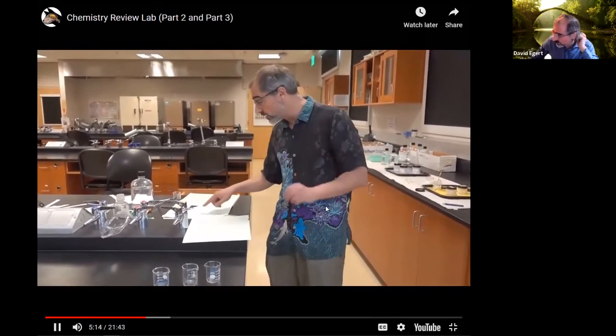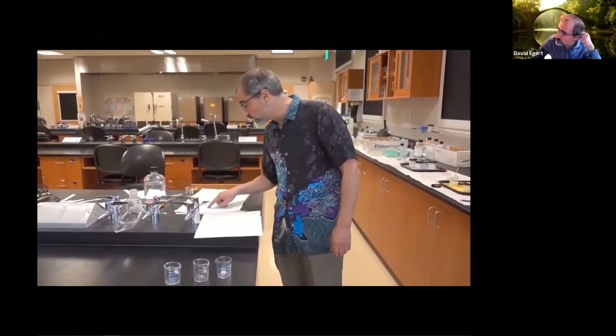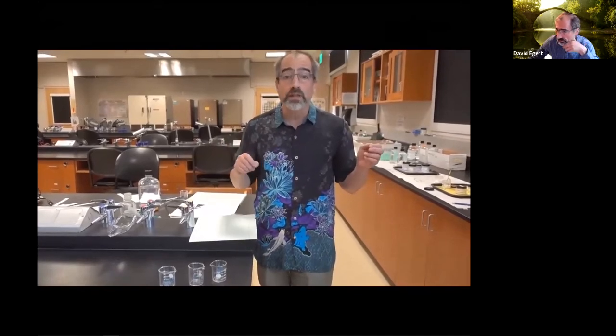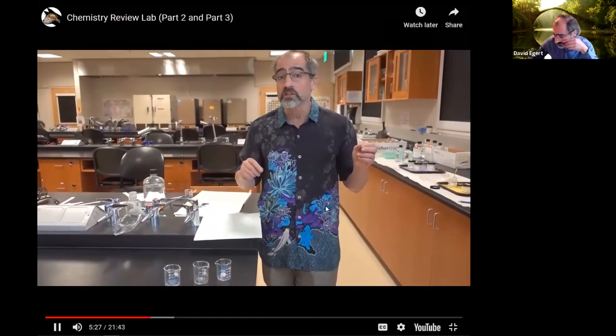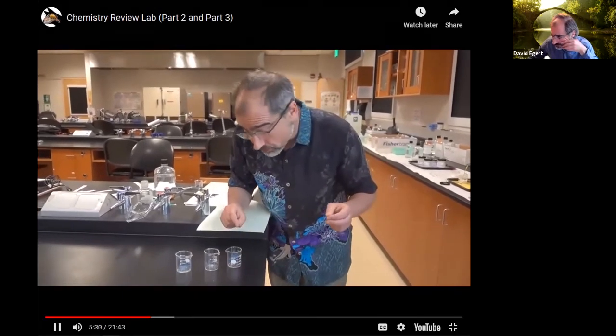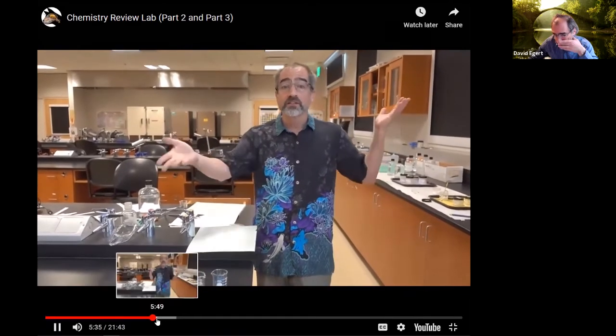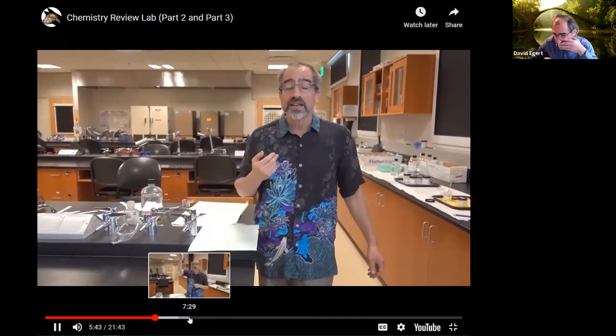And this is where you're writing things in your lab book. When it says, describe the appearance of the dry electrolytes, you actually want to record that in your lab notebook. Use your pen and write down the words that describe, granular, white, fluffy, whatever words. This is kind of a qualitative description here. So, there's no right answer other than it should reflect what your observation is. And it needs to be something that you record while you're actually experiencing it.